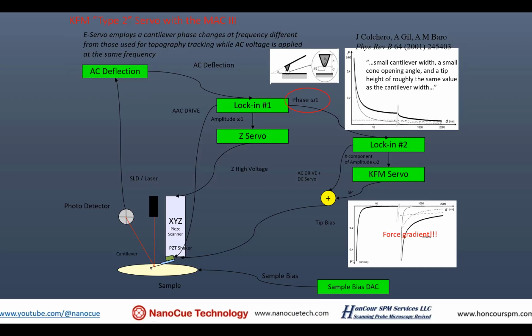The Kelvin force is very interesting. Suddenly the AFM image is no longer colorblind. There's information there, and then I try everything. It's part of anything that you try to identify, certain chemicals or whatever it is. I tried Kelvin force, and then I did it with graphene, with different kinds of nanotubes. You can differentiate nanotubes from metallic to non-metallic. Yeah, it's a lot of fun.